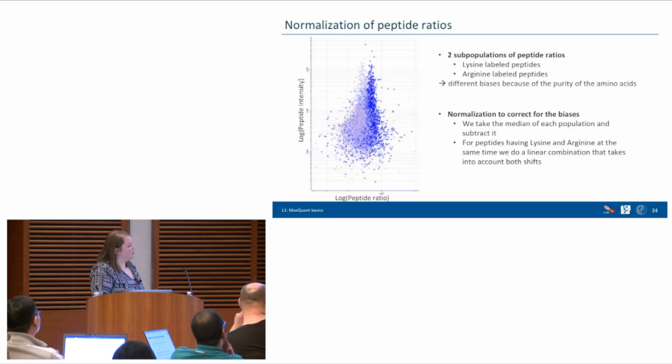Here, for instance, we know we would expect the peptide to be in these positions, and if you find there is signal in those positions, okay, this is my light partner, and we can connect those and then also do quantification.